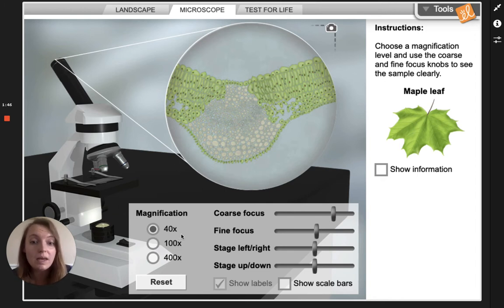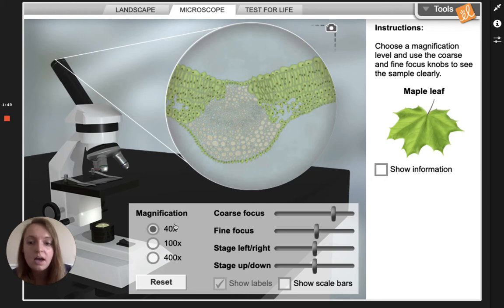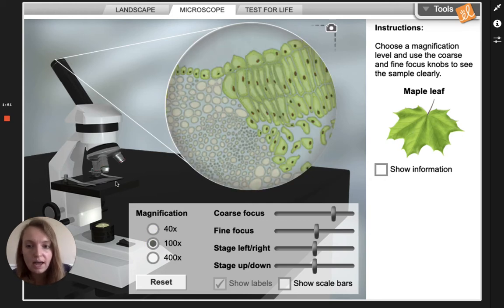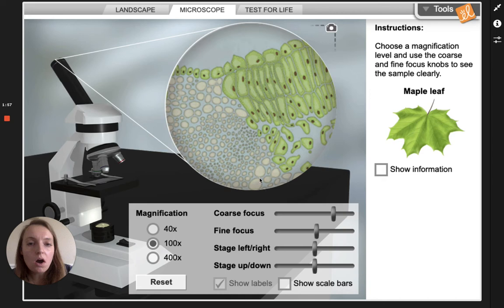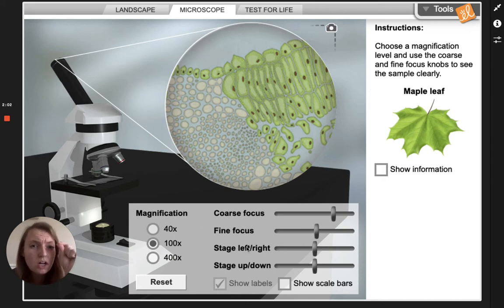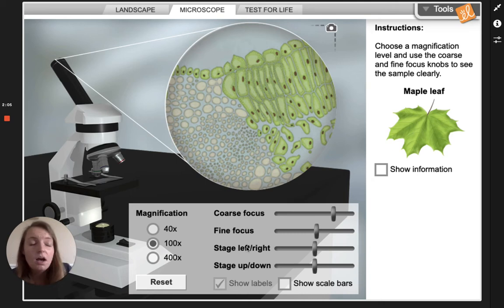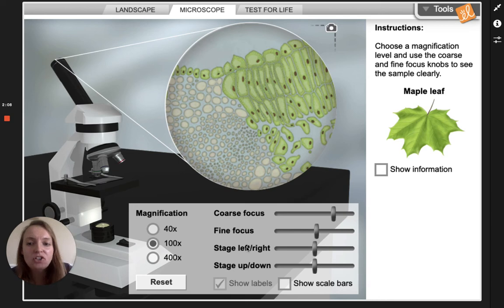I want to zoom in more. Now that I have it focused I can move up to the 100x. I've moved to a higher objective and look — we zoomed in. Now that we are using this longer objective we only want to move the stage a little tiny bit.